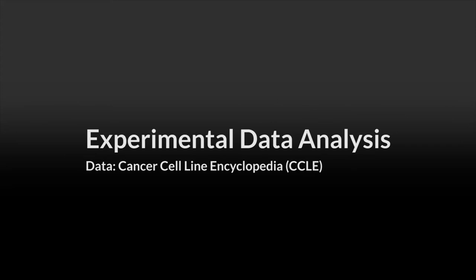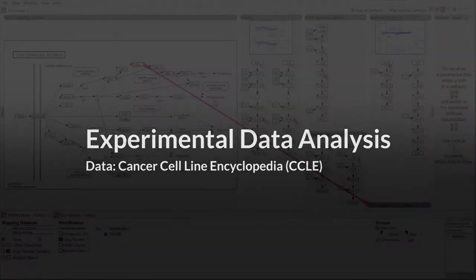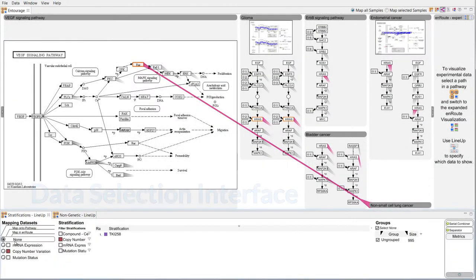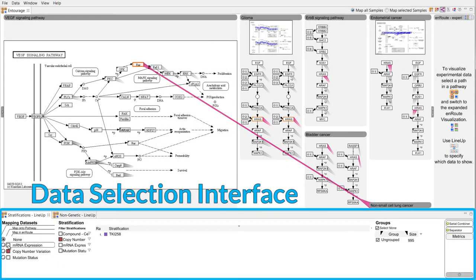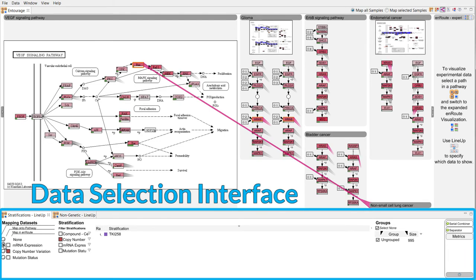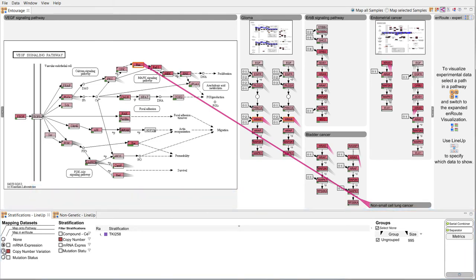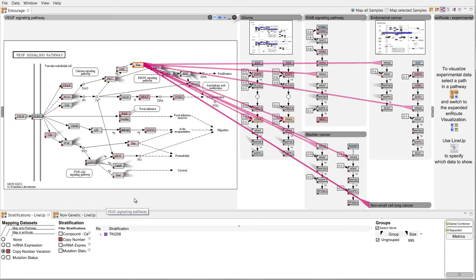Entourage also visualizes experimental data using two different approaches. We select the datasets in a dedicated interface. To get an overview of the values of a selected dataset we can map averages onto the nodes. The variability of the samples is shown in small bars below the nodes.